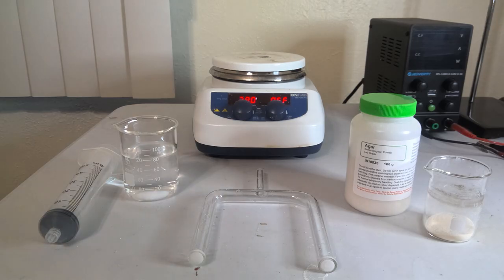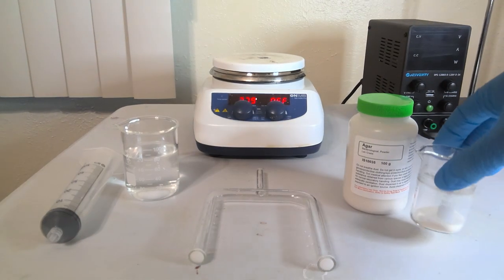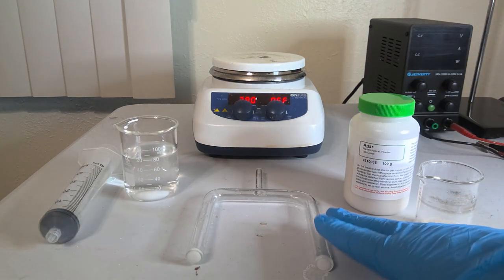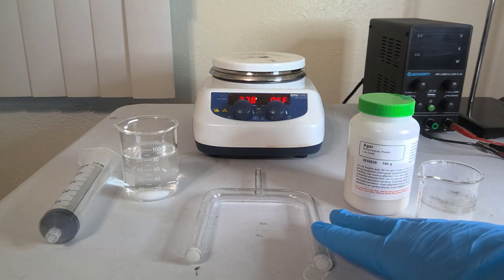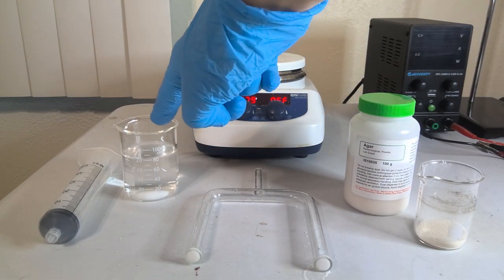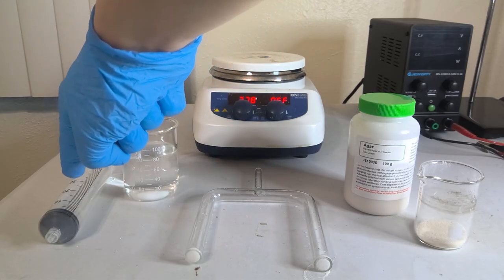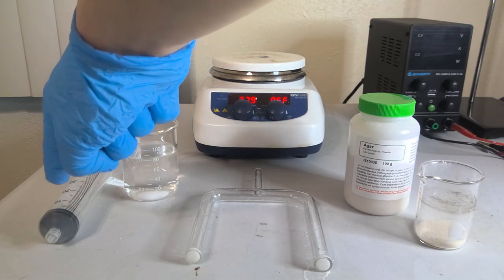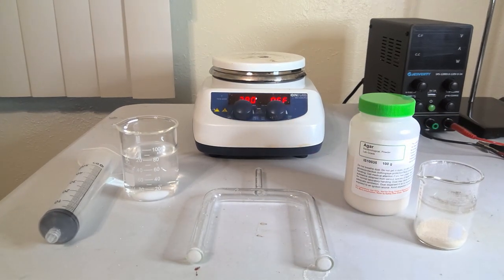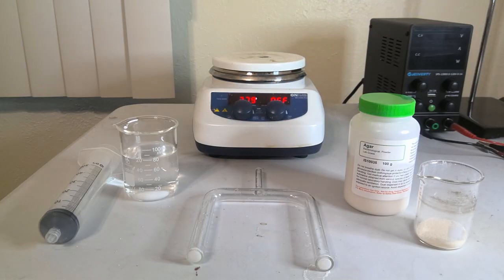So our material here — we got some lab-grade agar. I've got about three grams weighed out here. We have our salt bridge and we have a one molar magnesium sulfate solution. We have the syringe here for loading our salt bridge, and a hot plate slash magnetic stirrer.